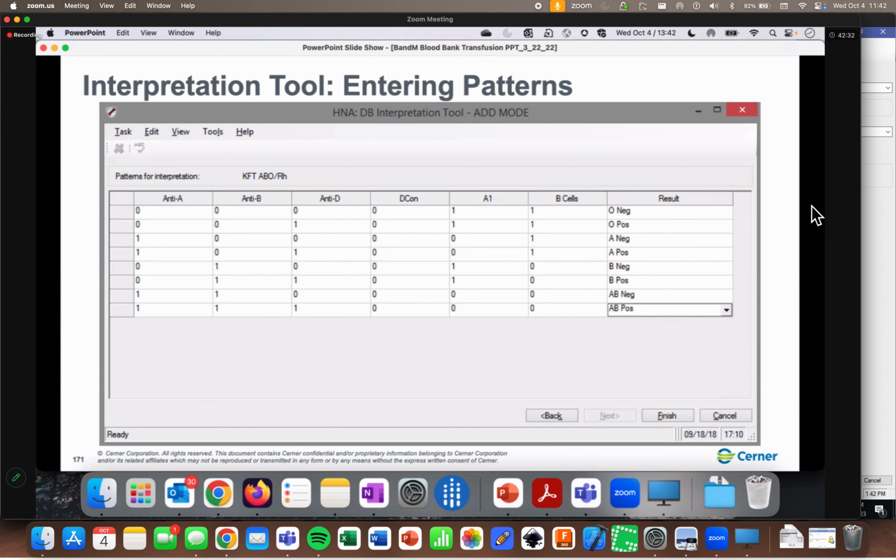The only things they're not fond of would be spaces. I don't like those at all. And special characters and punctuation. Those don't work either. Anything else is technically fair game for our hash identifiers, because this isn't anything the end users are seeing. They're just seeing, I put in result A plus result B and I get interpretation C. So we do have a bit of wiggle room there.